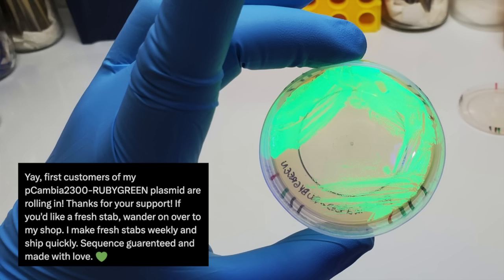And I have a bunch of agrobacterium plasmids that I'm happy to share if you need any to just jumpstart your process. I saw them on your website. They look really cool. They almost look like Gatorade sorta. They're pretty. Yeah. So I have a bunch of chromoprotein plasmids just so that people can do agar art with. They're like genes from coral that have different colors in daylight. And then I have my ruby green plasmid, which makes green in agrobacterium and ruby in plants, right? And that allows you to track the agrobacterium as it's doing its thing, and then you know it did its thing because then the plant is suddenly red, right? The one that you're generating.